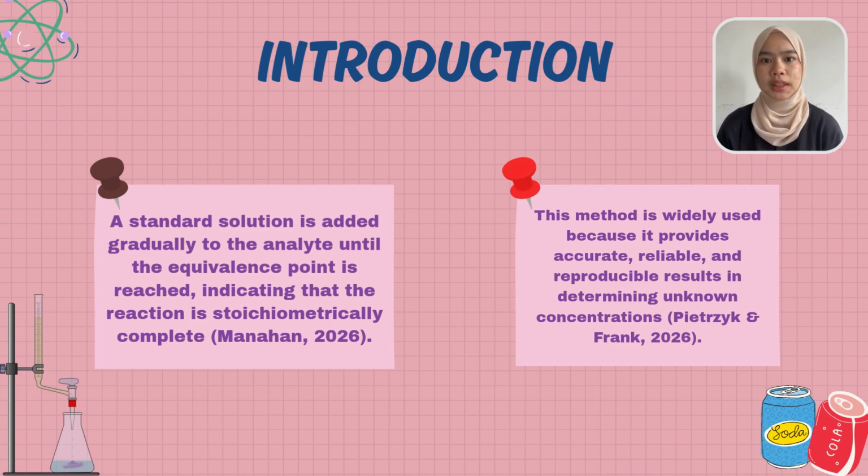Finally, this method is widely used because it provides accurate, reliable, and reproducible results. It is commonly applied in laboratories to determine the concentration of unknown solutions, especially in food, beverage, pharmaceutical, and environmental analysis.